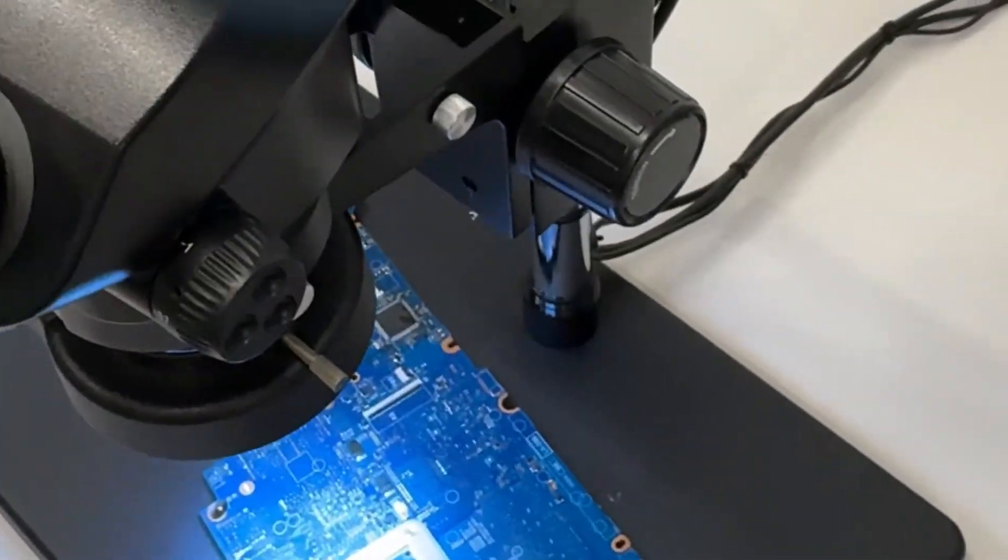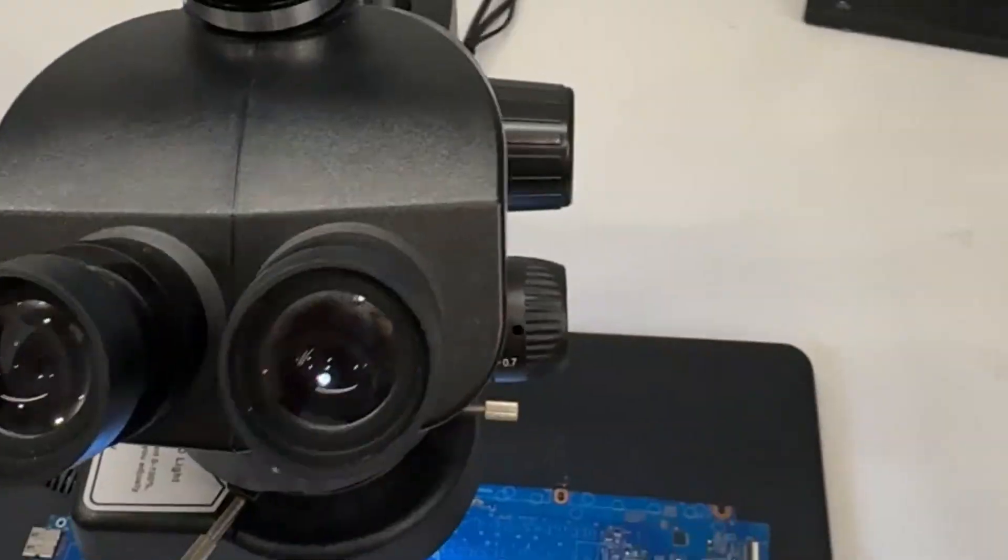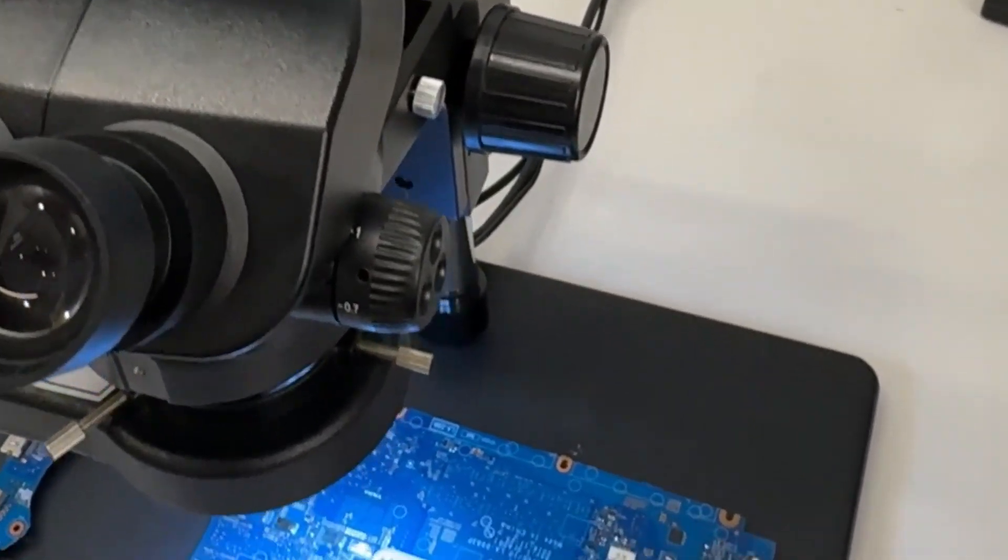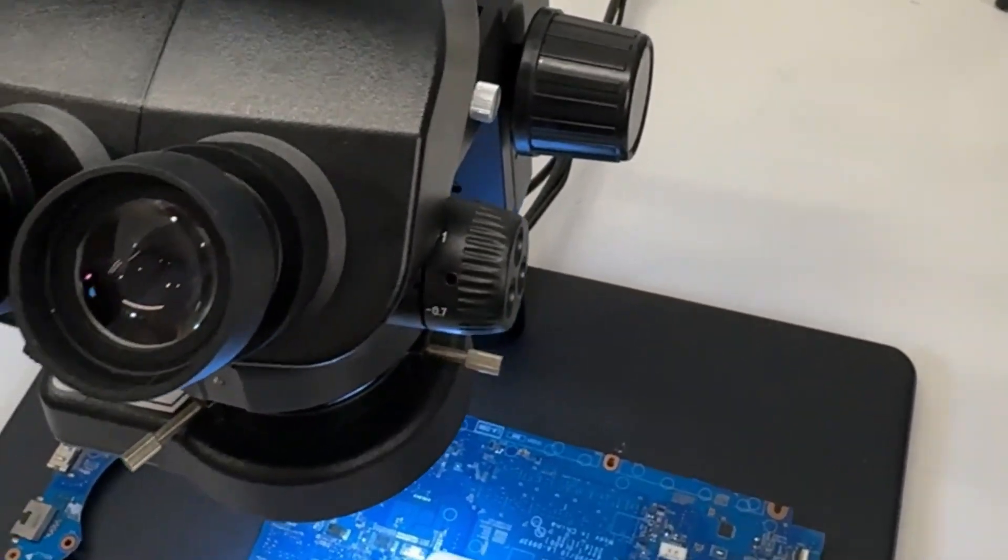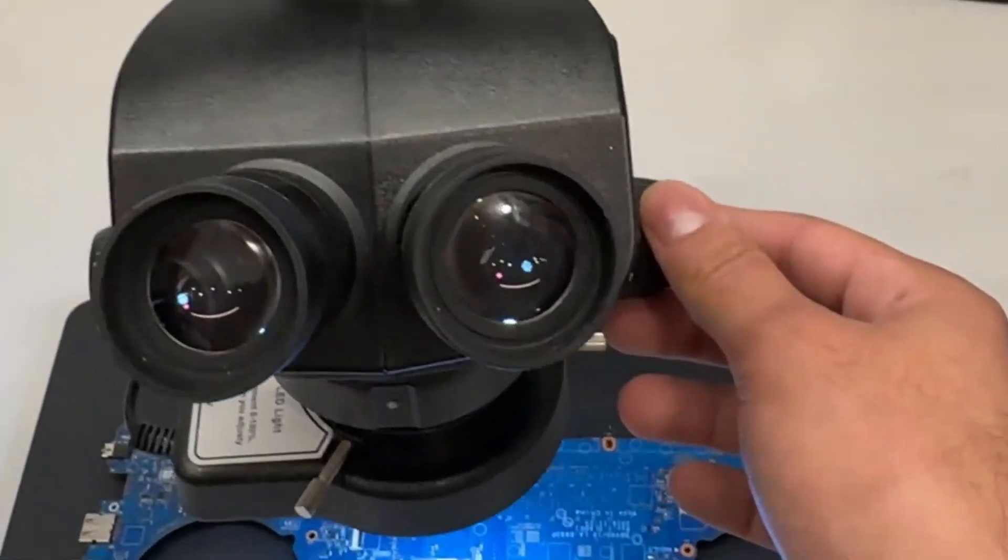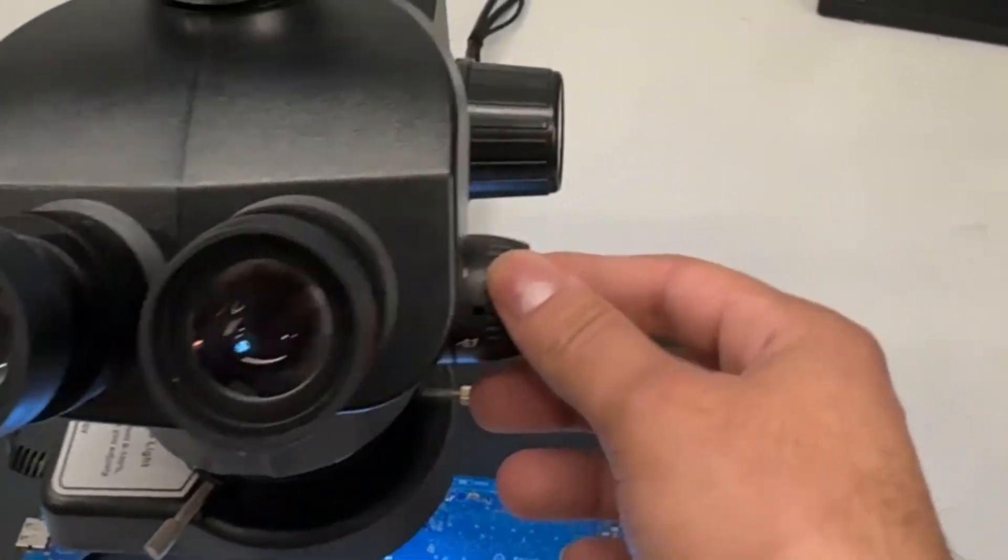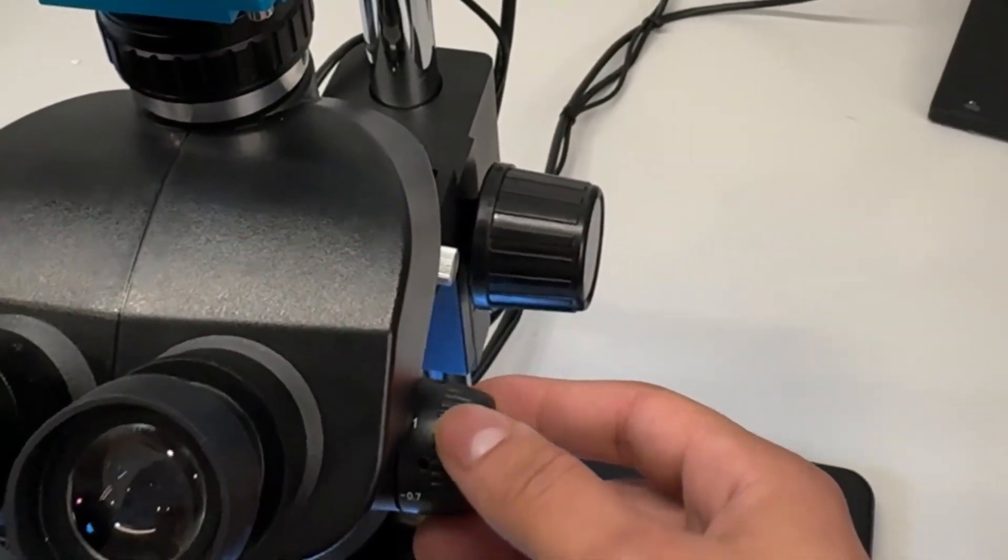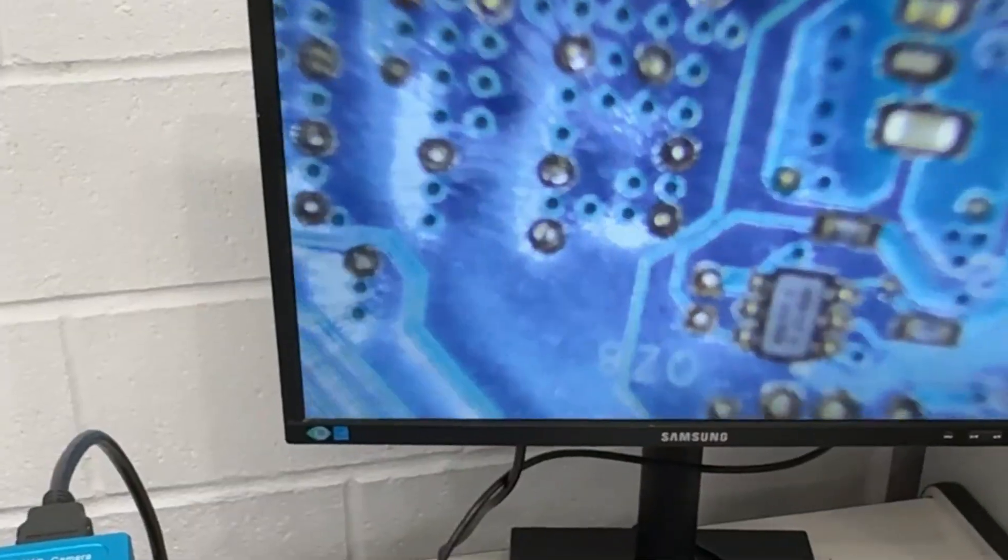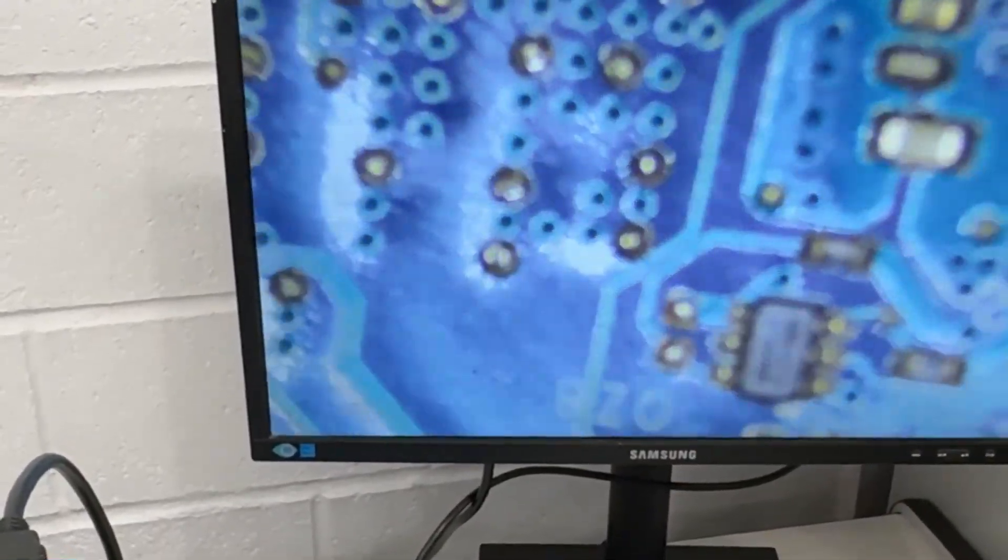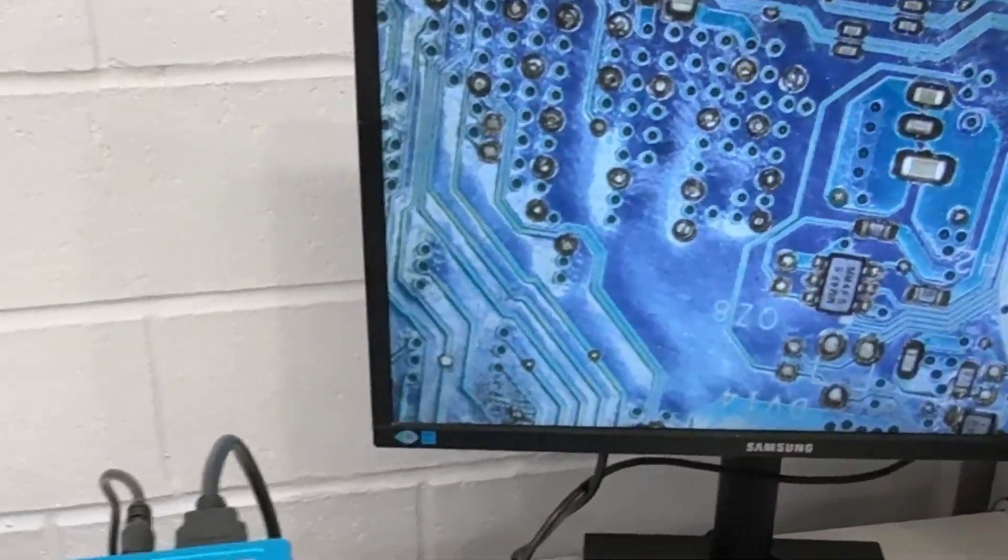So I forgot to mention about the zoom feature of this microscope. It works really well. Once you adjust all the focus points, which I'll explain shortly, it just works like a charm. You can zoom in, you can zoom out, it's amazing.